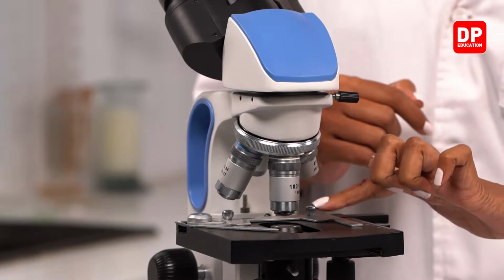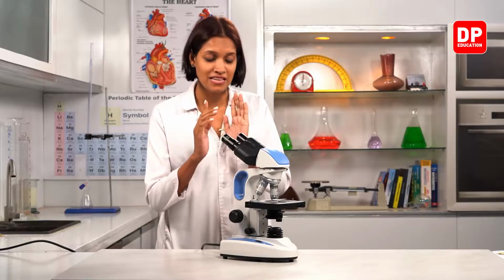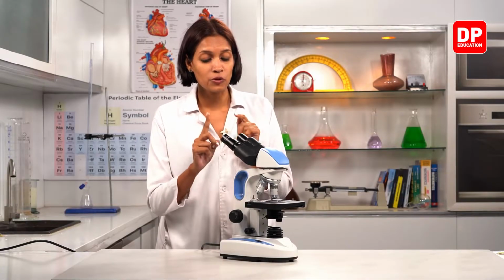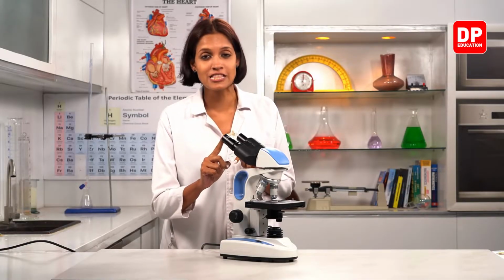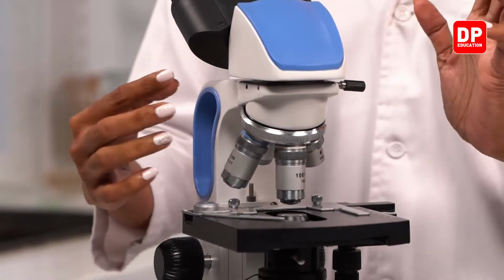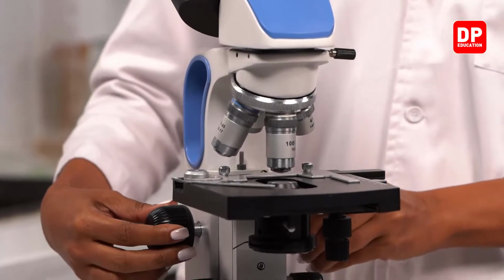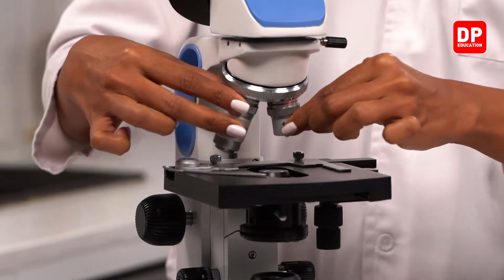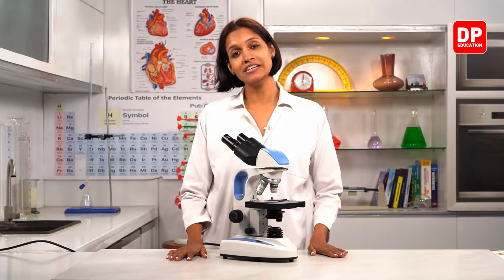Now this is where we place the specimen, right? This is where we keep the eyes. This lens is the closest to the eye, therefore it is known as the eyepiece lens. And these lenses are closer to the object, therefore they are known as the objectives. Remember, we can change the objective as we need, like this. Here we have 4 lenses, but normally in a basic microscope we have 3 lenses: low power, medium power and high power, right?